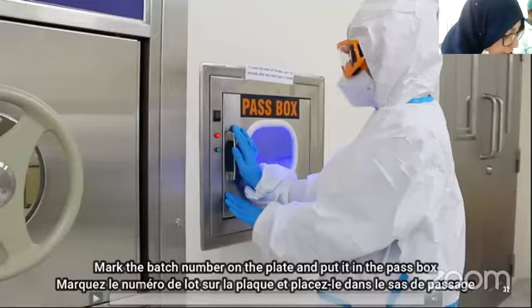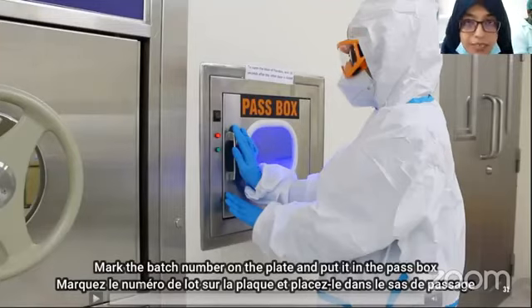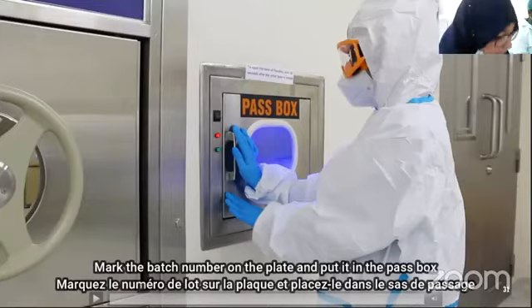Another question is how many microliters of carrier RNA are used per sample. So we are using 5.6 microliter of carrier RNA. We basically start by counting the number of samples, for example, if we have 12 or 15 samples, we multiply 15 by 5.6, and we take out the fixed amount of carrier RNA and add it into the AVL buffer. Because 5.6 is a very little amount and the chances of error may increase by using this 5.6 microliter of carrier RNA. The next is on bench RNA extraction.